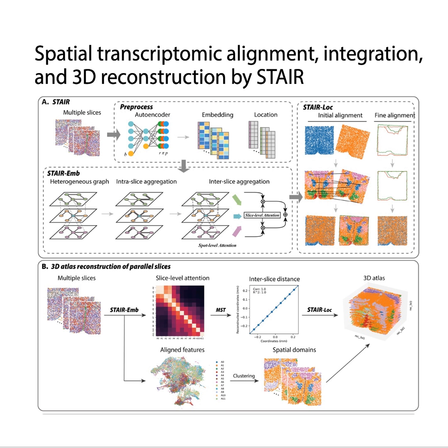And there's the geometric assumption. The model treats the tissue sections as being perfectly parallel. Yes. That parallel assumption really simplifies the math for the unsupervised z-axis inference. But real-world tissue prep often results in non-parallel sections or slight unknown cutting angles. Future versions will need to handle that geometric variability.